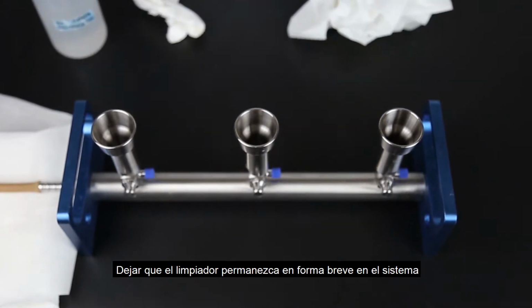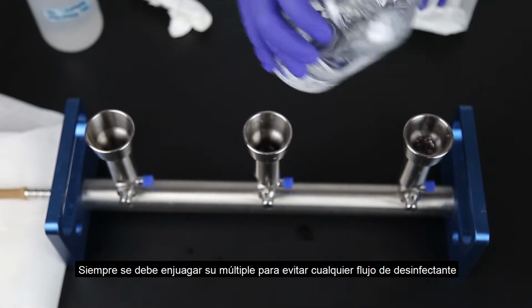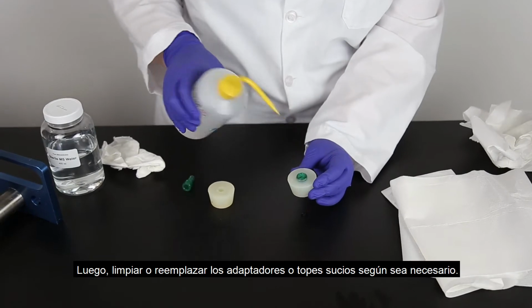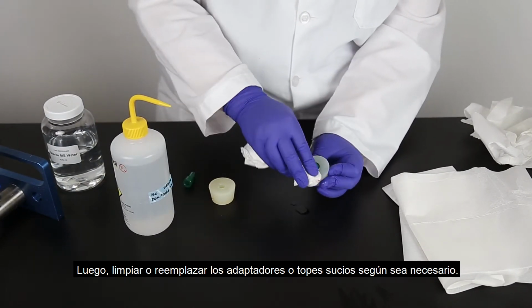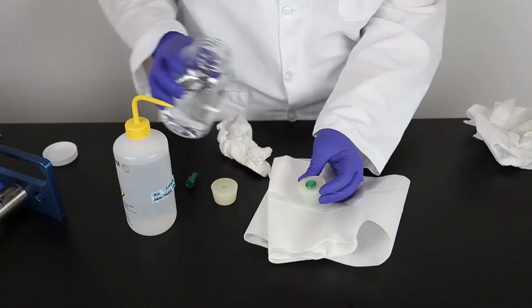Let the cleanser stay in the system briefly prior to rinsing it with sterile water. Always rinse your manifold to prevent any backflow of disinfectant into the system that could negate the results of a future test. Next, wipe down or replace dirty adapters or stoppers as necessary. If you add any disinfectants, remember to rinse them clean with sterile water.